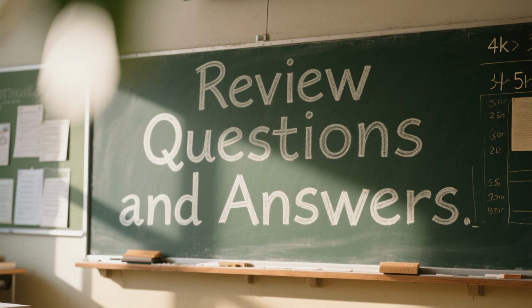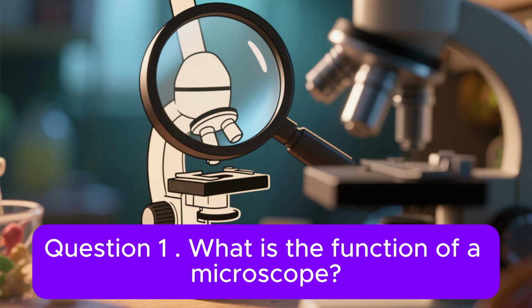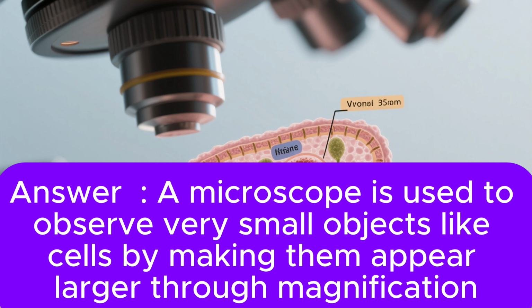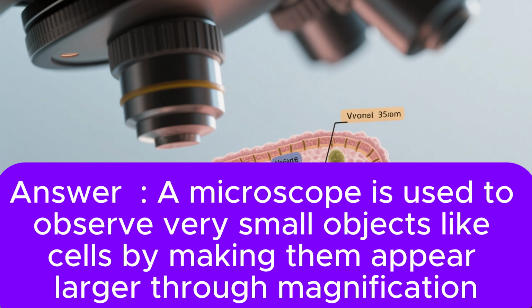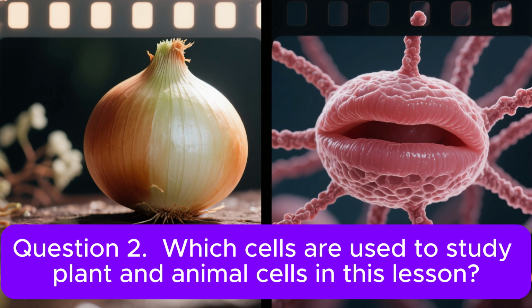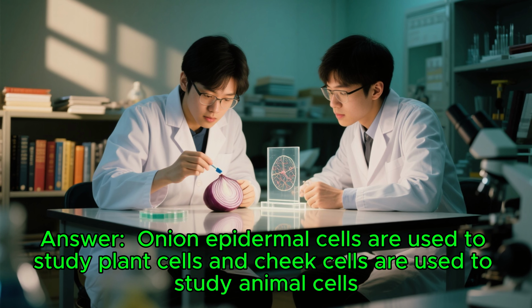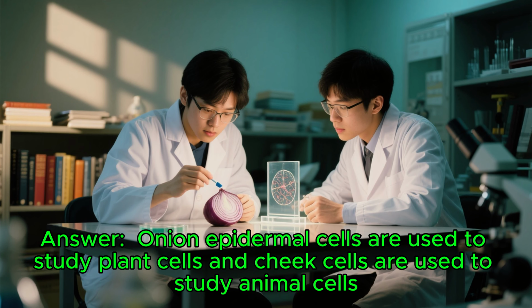Review questions and answers. Question 1. What is the function of a microscope? Answer. A microscope is used to observe very small objects, like cells, by making them appear larger through magnification. Question 2. Which cells are used to study plant and animal cells in this lesson? Answer. Onion epidermal cells are used to study plant cells, and cheek cells are used to study animal cells.